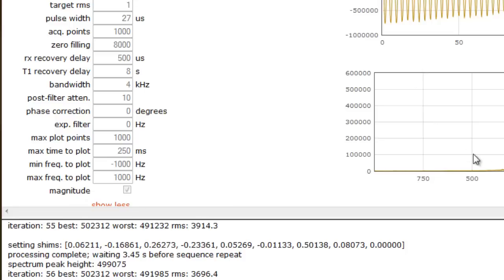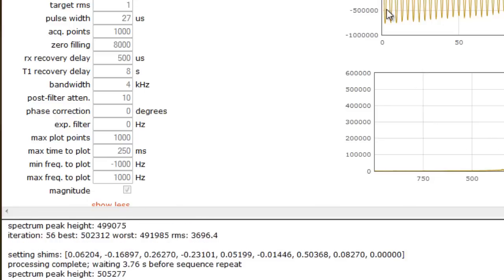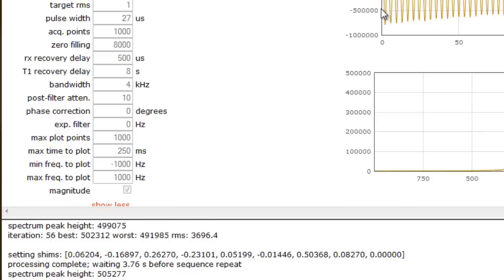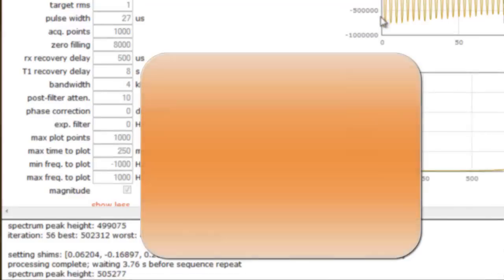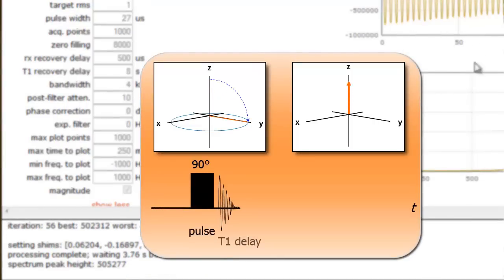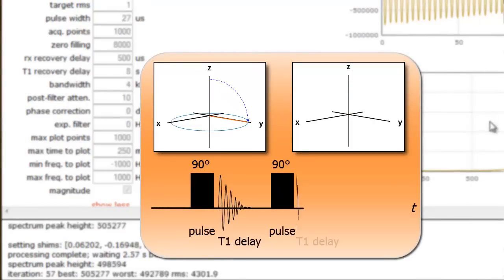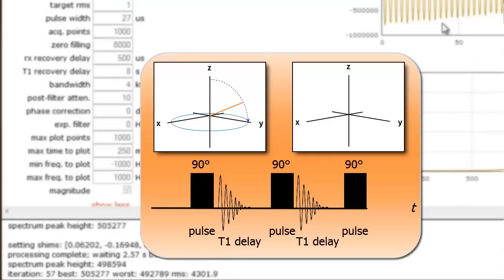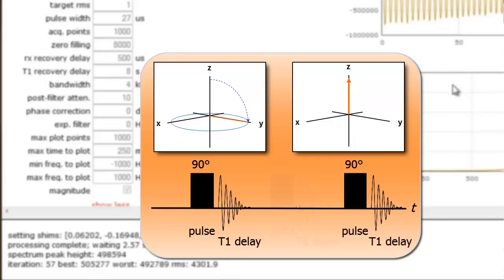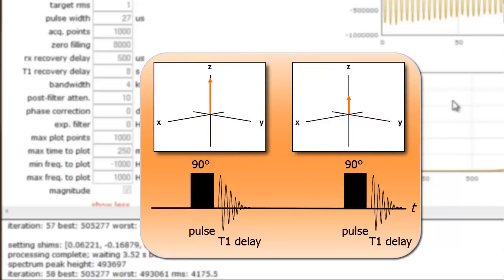Returning to the scrolling text, let me comment on the information contained in the line Processing Complete. When executing either the AutoShim or OnePulse scripts, the Fourier transform of the complex data acquired is performed during the T1 delay. If we want consistent evaluation of the spectrum peak height, we need to make sure all data processing is completed within the T1 delay we set.